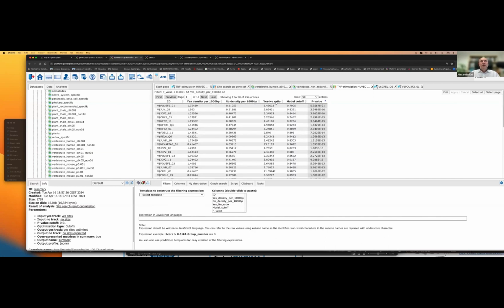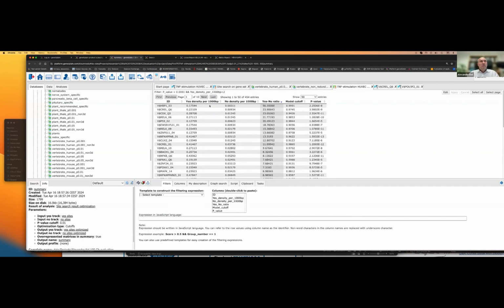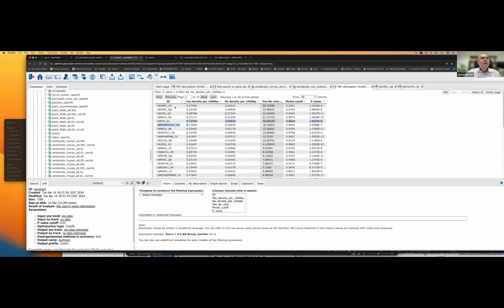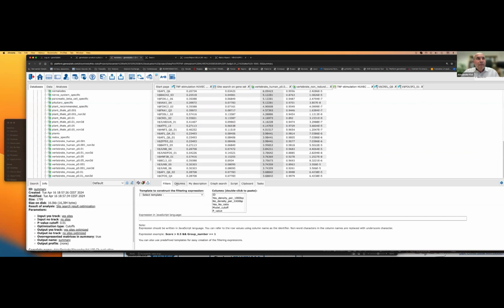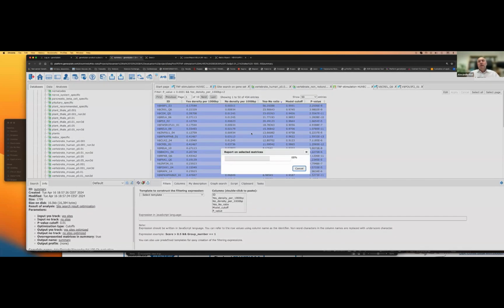Okay, still 400, but we can sort it by the yes to no ratio and take the first 50 of them. Sometimes on Macintosh it's not always working. All right, so we mark them all, and then we want to visualize them all together.